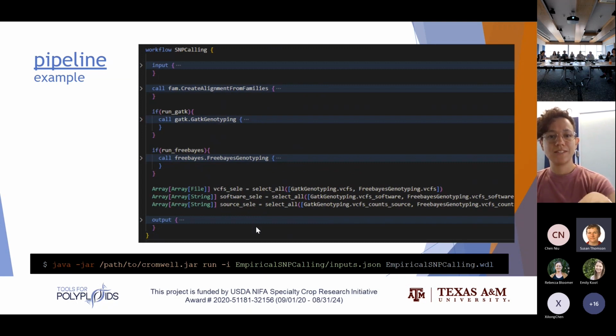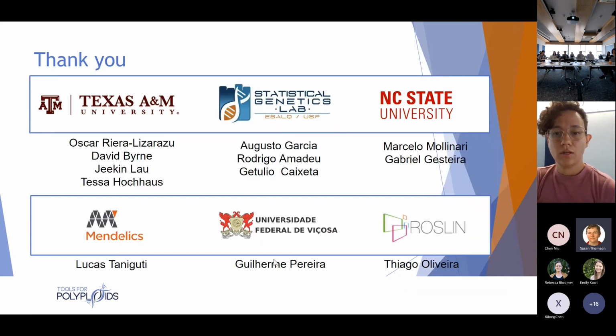And just the same, here is the workflow. So I put not only the freebayes sub-workflow that I just showed you, but I included the GATK too. So I'm including more things. And you can run them separately, as I can show here. And that's it. We'll start to work with your own hands now.